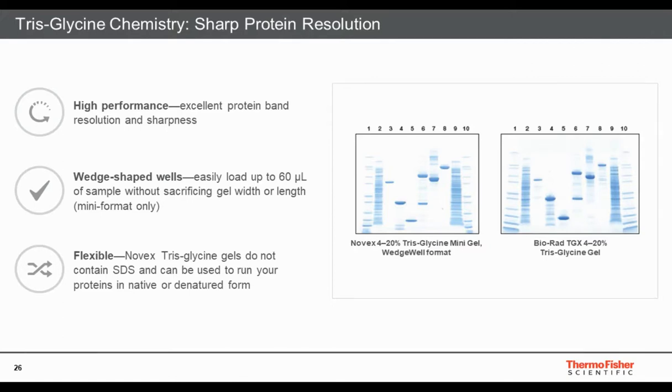You can see better separation of multiple protein bands in lysate, and the Novex TG gel also shows relatively less protein degradation of purified protein. The protein bands are sharp and straight and do not show the smiling of bands, particularly in the first and the last lane, which is very visible in Biorad TGX gels.